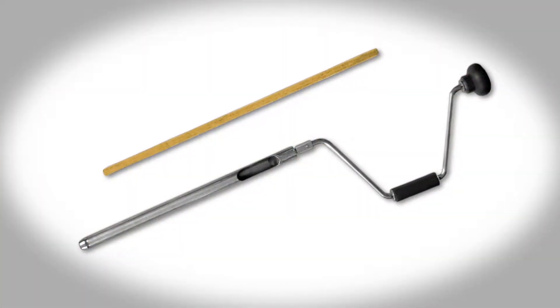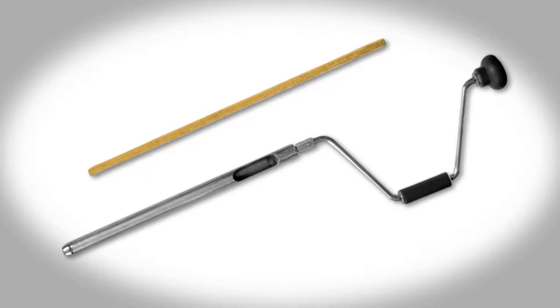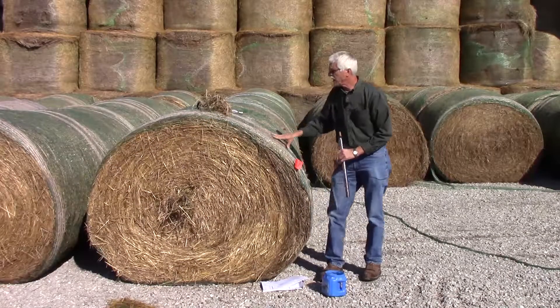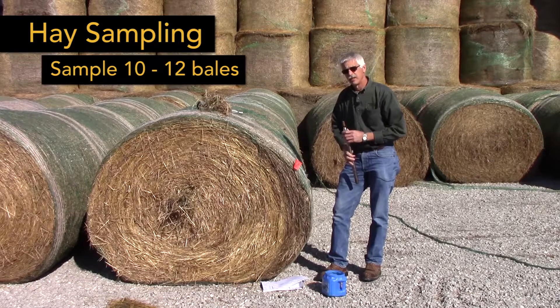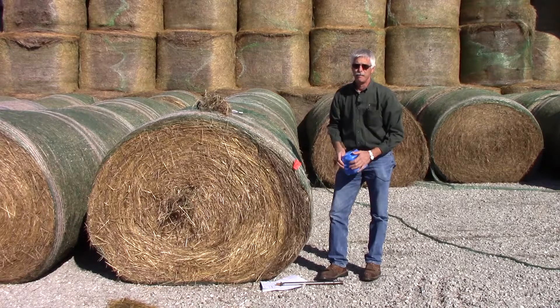Many extension offices will have these probes that you can borrow to sample hay. For each lot of hay, you want to sample about 10 to 12 bales, and that would be a subsample that you then combine, mix up, and send off to the lab.